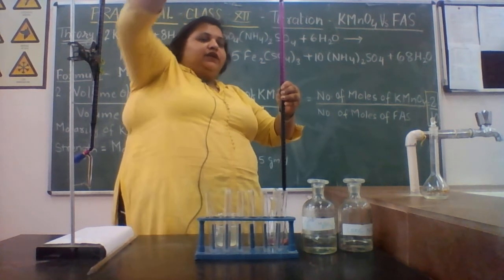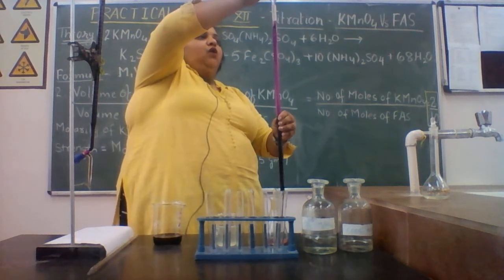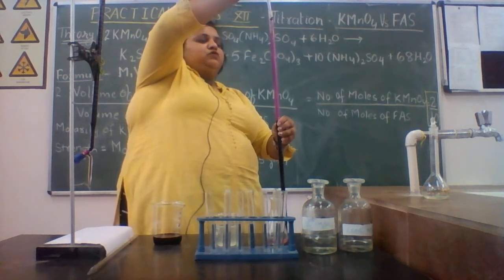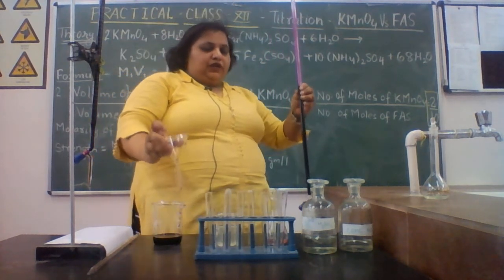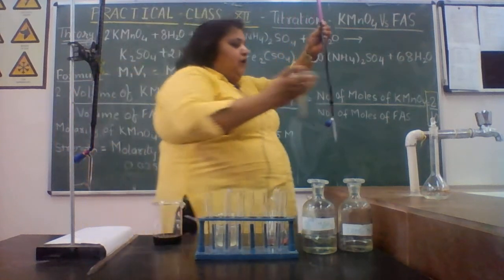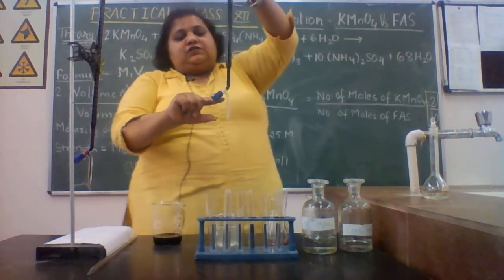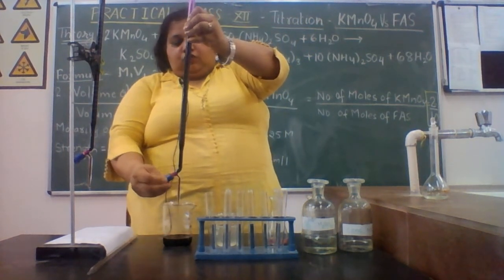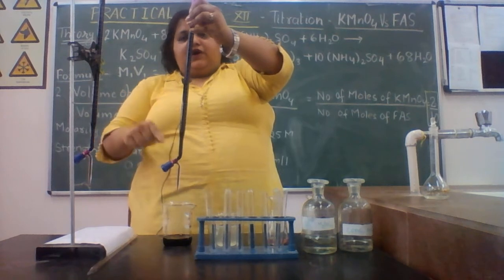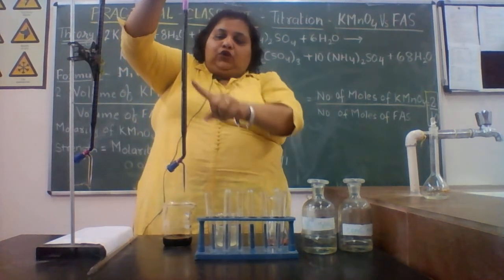I have already done this for you. Just to show how to fill this, I have shown you the precautions that you need to take at this step. You can see this part is empty. You have to flow the solution very fast like this. Now, this will be filled and there should be no air gap.